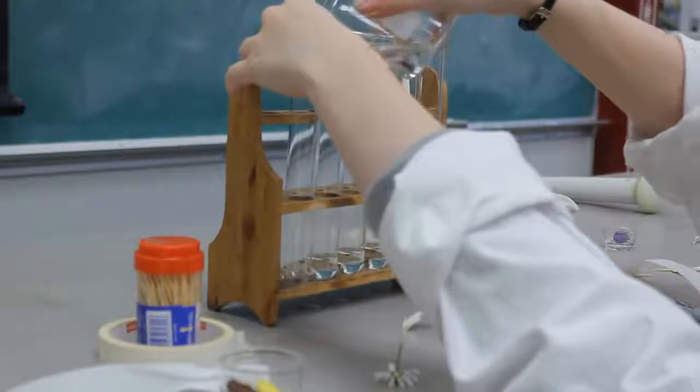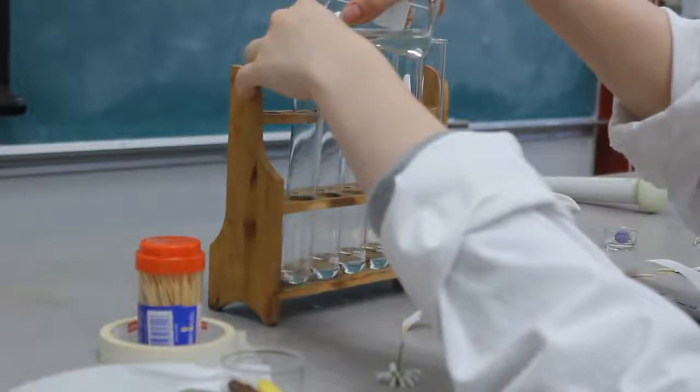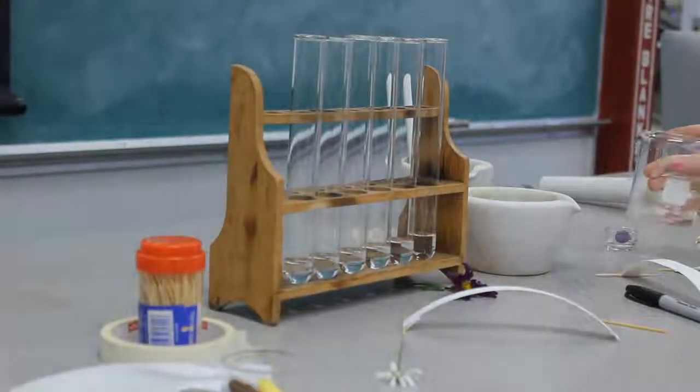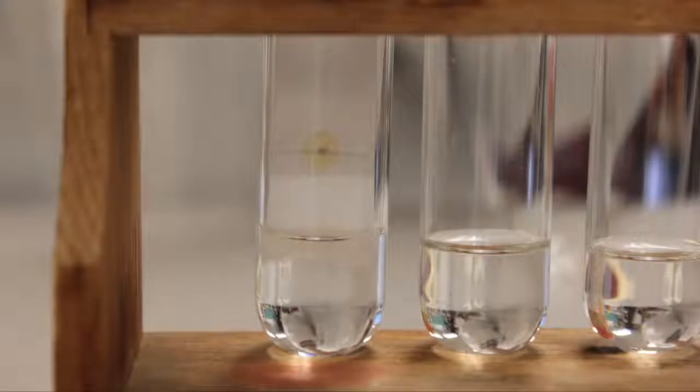Next, pour acetone into the test tubes so that it barely touches the bottom of the filter paper once it's inserted into the tube. Depending on how long your strips are, it's about a half an inch of acetone at the bottom of the test tube.